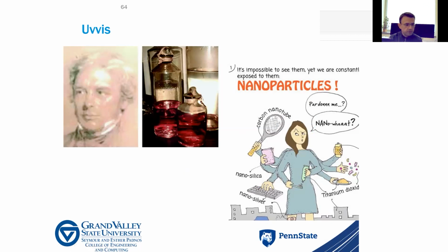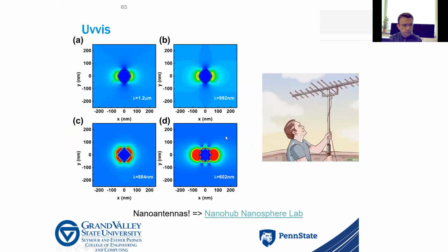are very high research areas in the field of nanoparticles, for example. So we look at the solution with nanoparticles, and it changes its color. That's all about the UV-Vis, ultraviolet spectrum analysis, because you send optical spectrum light and we see that it shines us back. Those nanoparticles inside the solution give us a red color. And it's just like these nanoparticles are like little antennas. They resonate at certain frequencies.